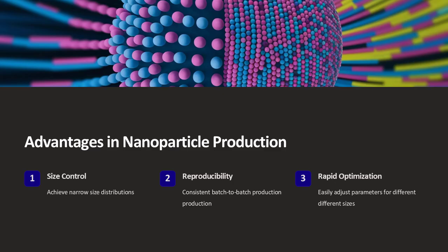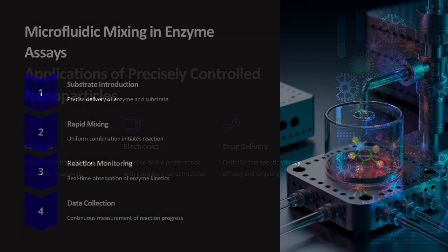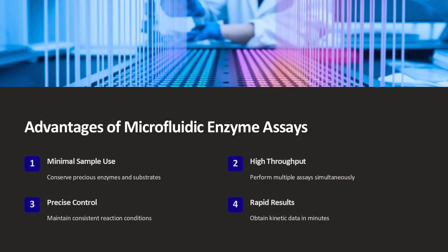Furthermore, the integration of real-time monitoring systems into microfluidic mixers allows researchers to observe the mixing process as it happens. High-speed cameras, fluorescence imaging, and laser-based detection systems can be used to visualize and quantify mixing efficiency in real time. For example, fluorescent dyes may be introduced into one of the fluid streams, and as the fluids mix, the gradual homogenization of the fluorescent signal can be monitored and quantified. This data not only validates the design of the mixing channel, but also provides valuable feedback that can be used to fine-tune flow rates, channel geometries, and other parameters.